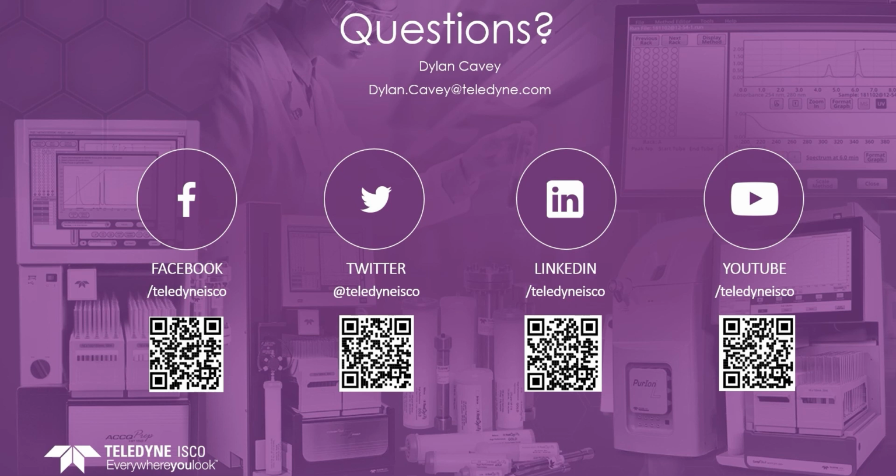For our first question, it's one we get quite often: how can we increase the separation between our compound of interest and any impurities or other compounds? If we're running TLC plates, we're looking for a change in Rf between our compound of interest and any other compounds or impurities to be greater than 0.2. If you find that some impurities or other compounds are within that 0.2 range, we might have to look at different solvent systems.